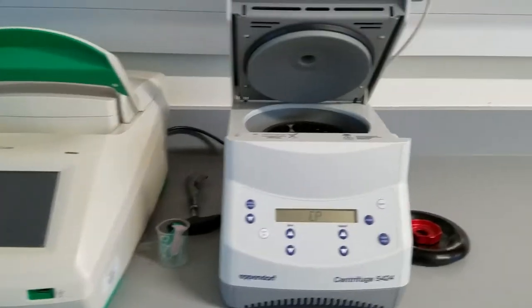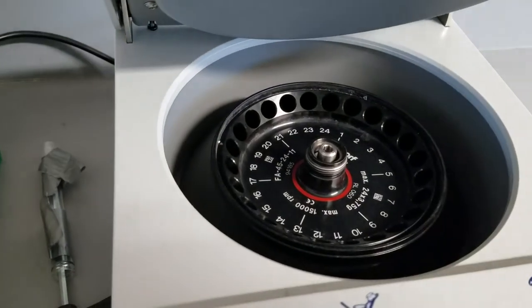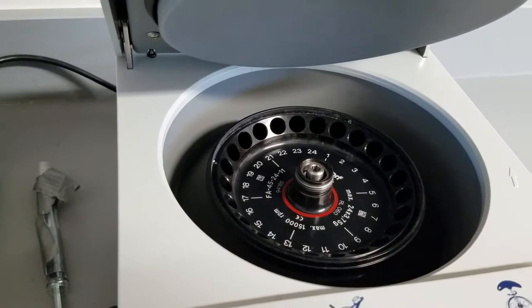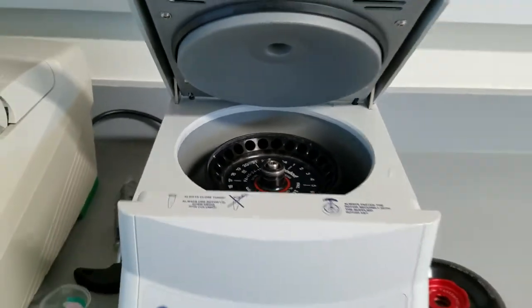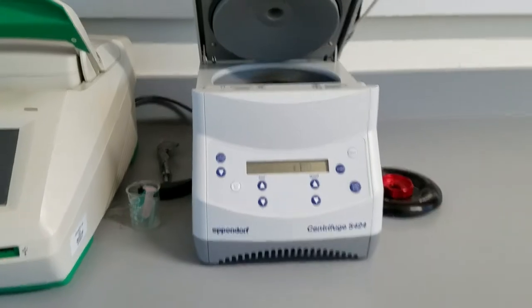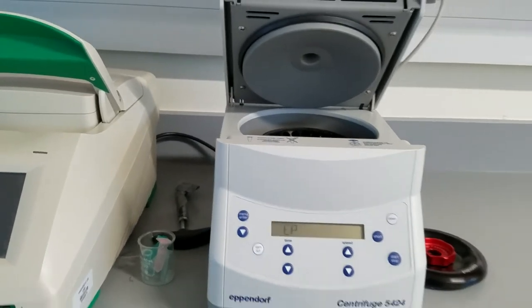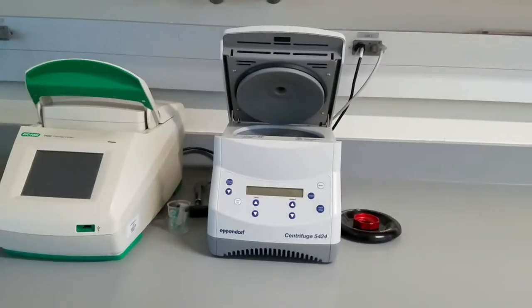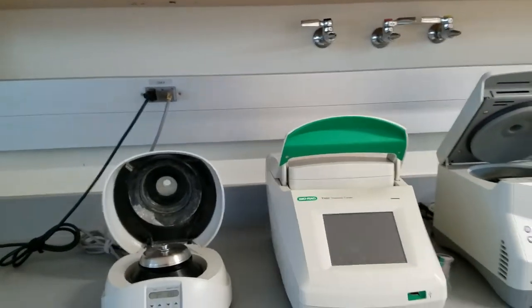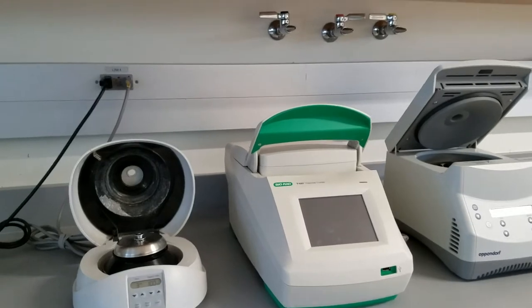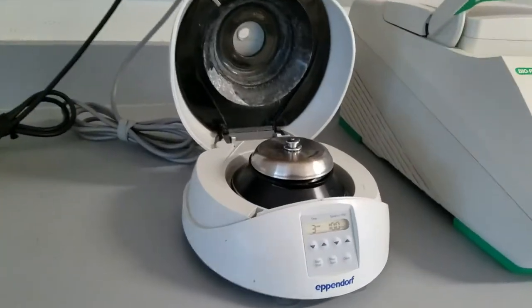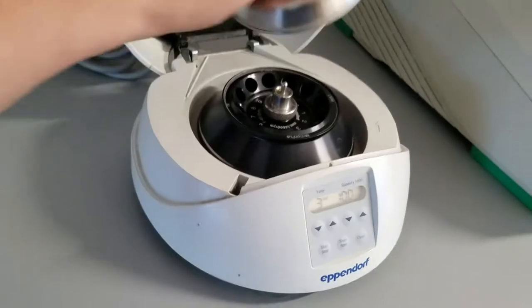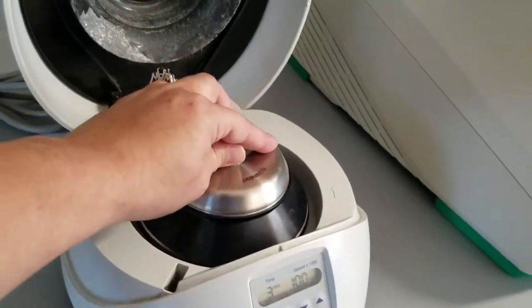Next we have some centrifuges. Here is a small one. This takes small tubes anywhere from 0.6 all the way up to 2 mls. These centrifuges go up to 14,000 rpm - rotations per minute. We use this to extract protein, to pellet down cells, to pellet our DNA, all kinds of different things. We also have a small centrifuge right over here that we can also use sometimes as well.